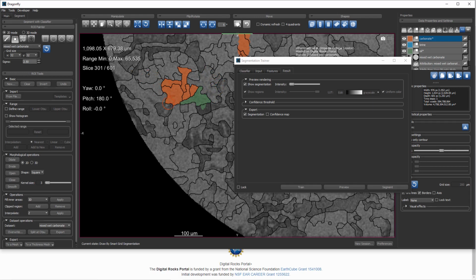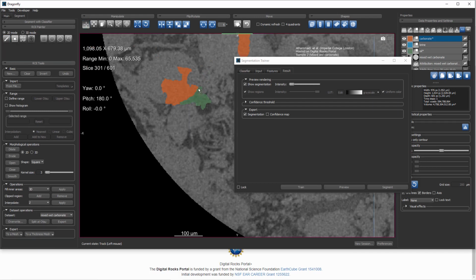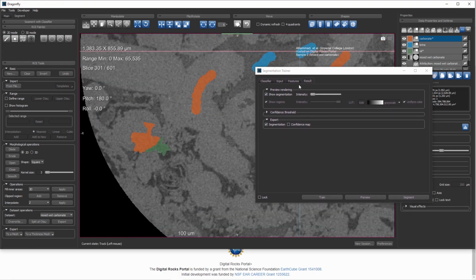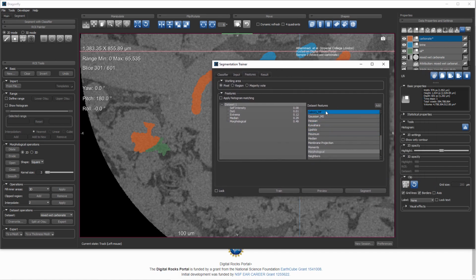So it is a very good idea to include edges. If you segment all the way up until the edges, then your segmentation has better training data. So just a little bit like that might make the model improve a little bit better. Now, if you're working in this space and you really don't know anything about these image filters and you don't know which ones to choose, well, you could choose different ones based on our suggestions or by guessing, and you can look here and see which of the image filters actually has a higher weight in the final answer. And if you have a good answer, then maybe you just delete some of the ones with small weights. If you don't have a good answer, you may add more and see if you get some more contributing to a better segmentation.